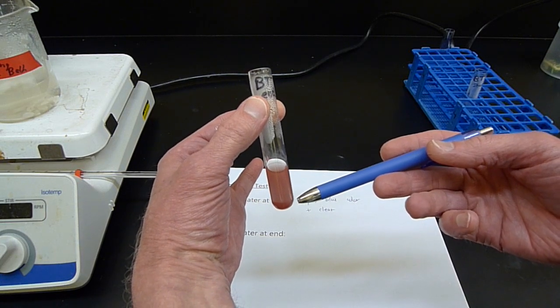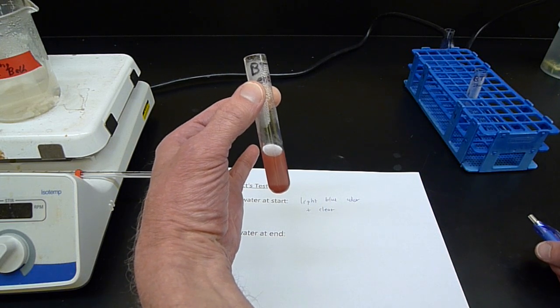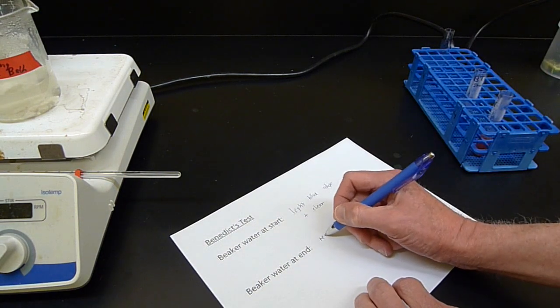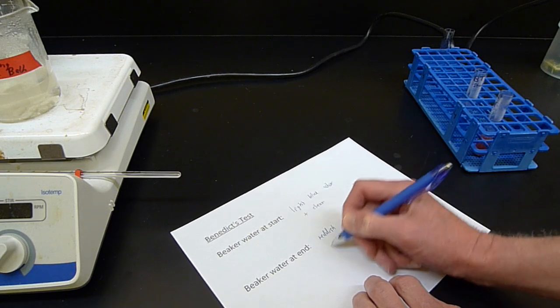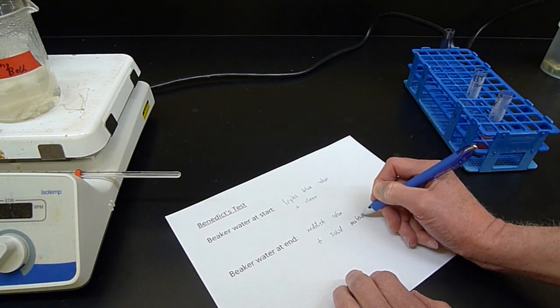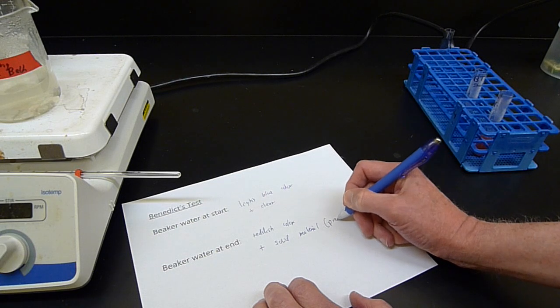If I don't mix this, it's settling out. And that's a solid material. We call that a precipitate. So it's a reddish color, and clearly solid material in there that's floating around and settling out.